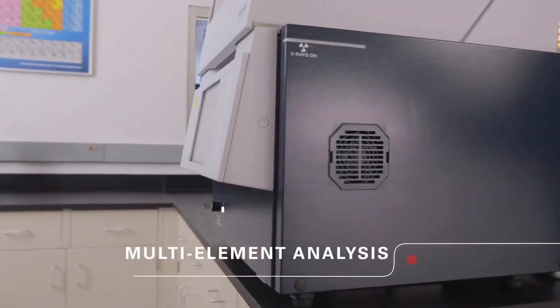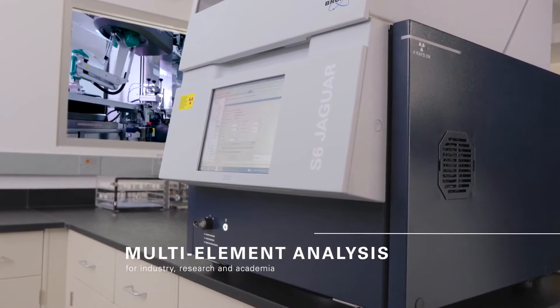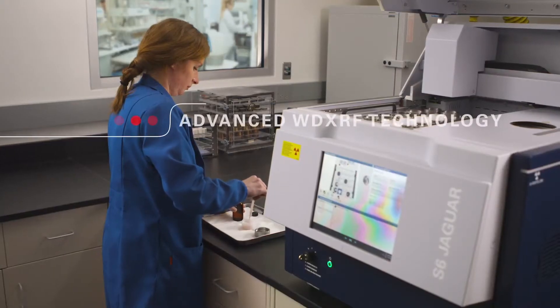Need performance, but tight on bench space? The S6 Jaguar Wavelength Dispersive XRF delivers, with its compact size and plug-and-analyze installation.